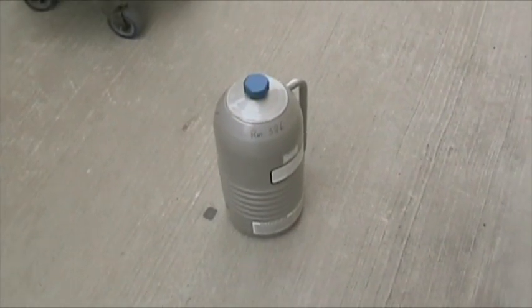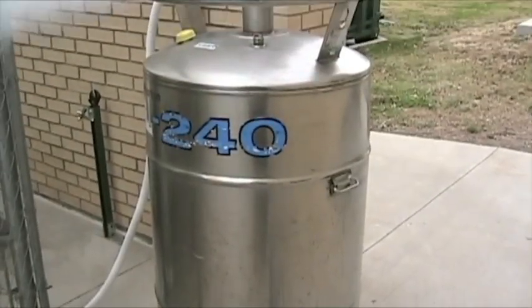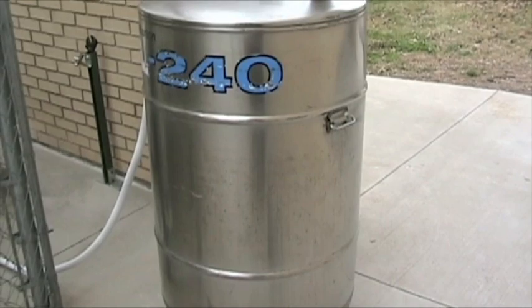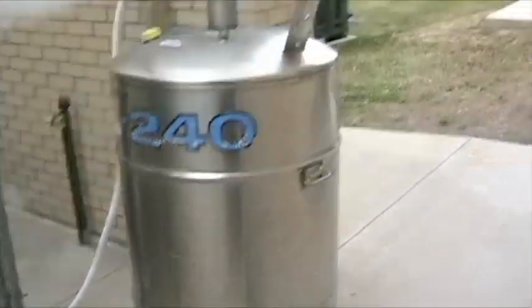I'll have to make this quick. In a previous video, I told you how I filled this small dewar with liquid nitrogen using this larger dewar. Well, unfortunately, this is not magically filled with liquid nitrogen forever, and it does go empty, so we do have to fill it up.